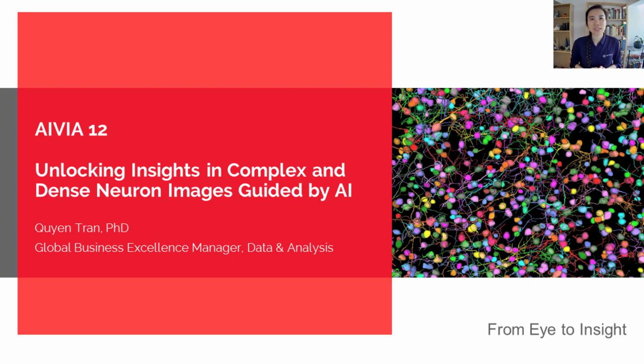Today, I'll be introducing you to our latest release, Aivia 12, in which we introduce tools that help you unlock insights in complex and dense neuron images.